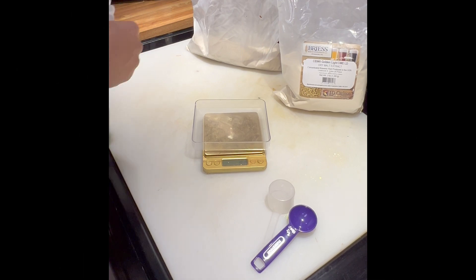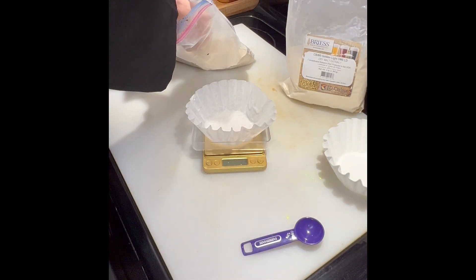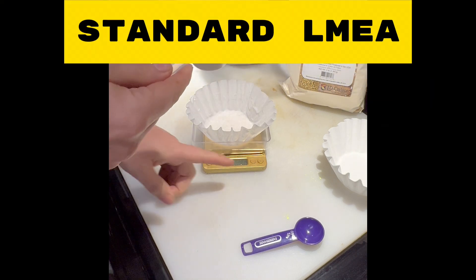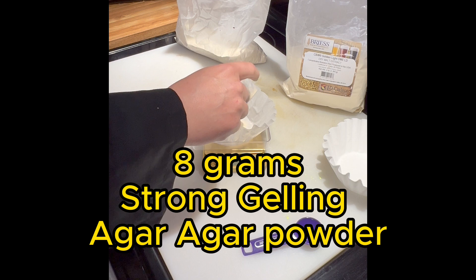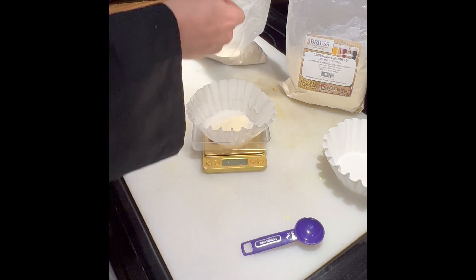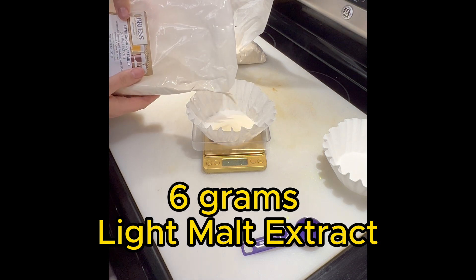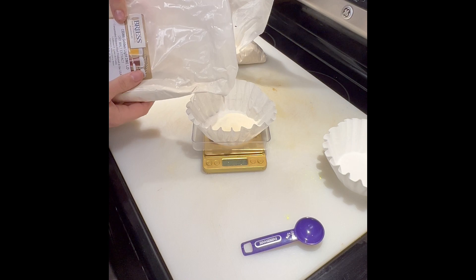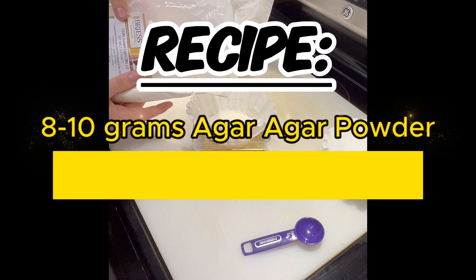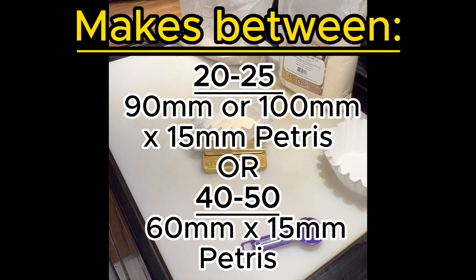Today's video is about agar and media preparation and melting. We're going to use a standard LMEA recipe — I'm going to start with 8 grams of strong-gelling agar agar powder, or 10 grams if you don't know the gelling strength, and 6 grams of light malt extract. I like the light stuff from Briess — I think it's a Pilsen malt extract. This recipe will make you around 20 of the 90mm plates or around 40 to 50 of the 60mm plates.